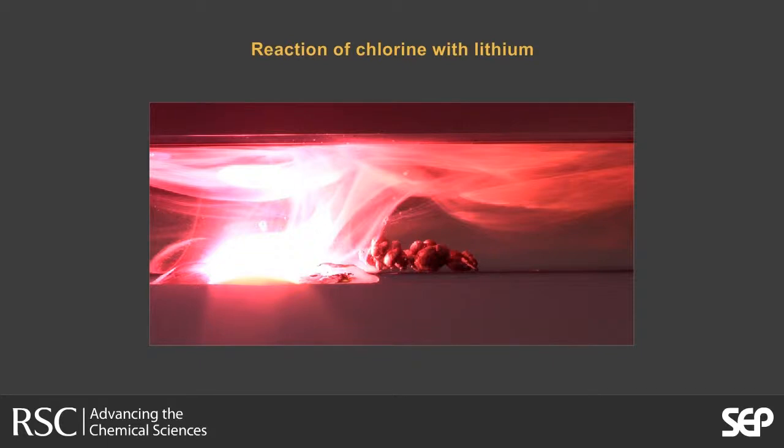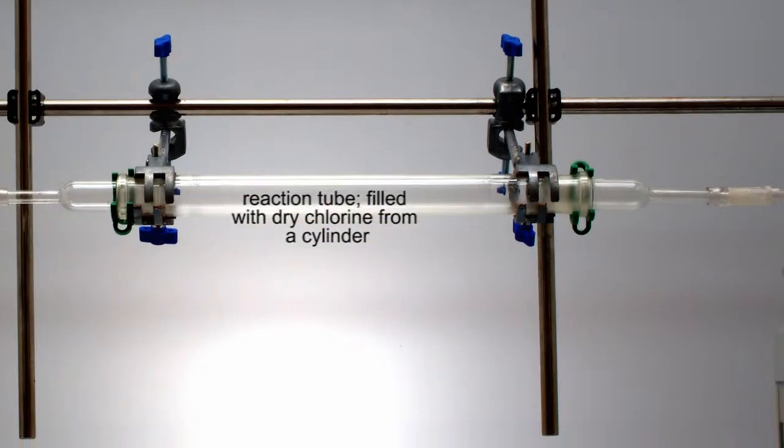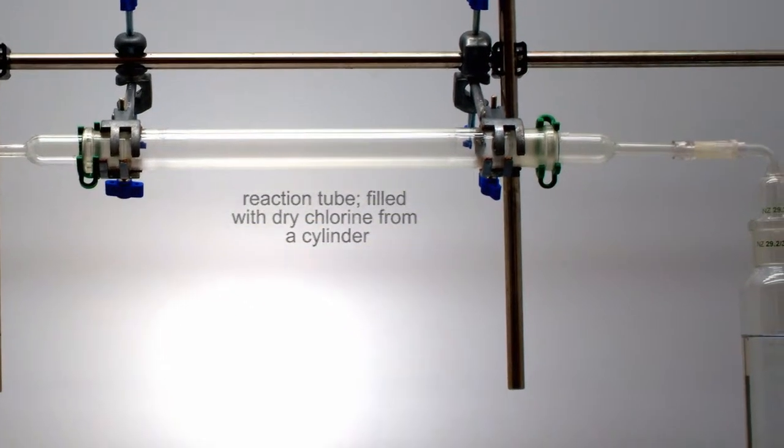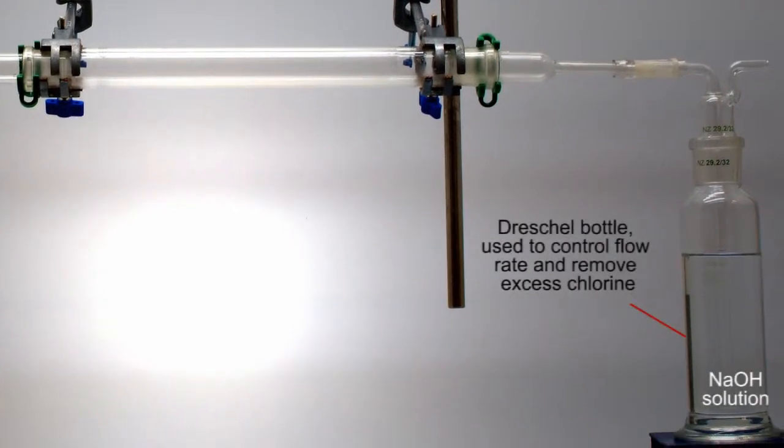In this reaction, chlorine from a cylinder is used. For the reactive alkali metals, the tube is first purged with argon. The exhaust gas is bubbled through strong sodium hydroxide solution, which also allows some control over its flow rate.